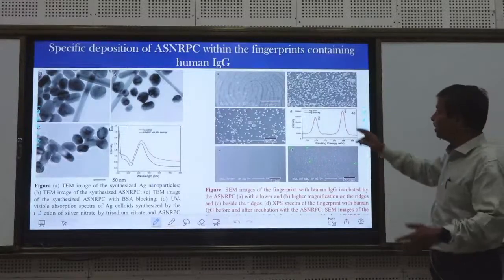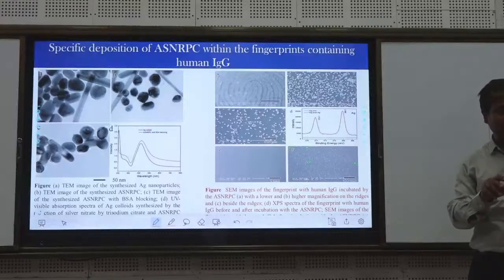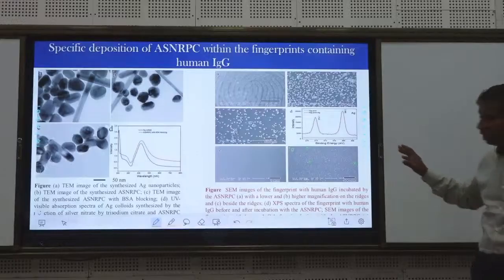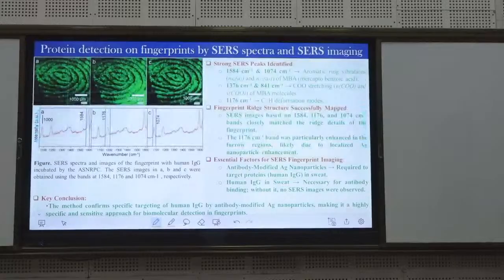So what I wanted to tell you is that through this technique, they are trying to find out the information on protein, because this explosive will be in touch with the protein. So unless you deduct the protein contribution, you cannot find out the true explosive's Raman spectrum. So that is the same one.